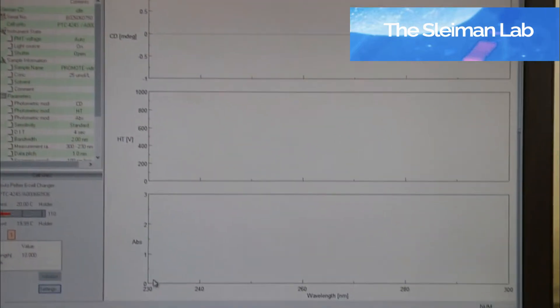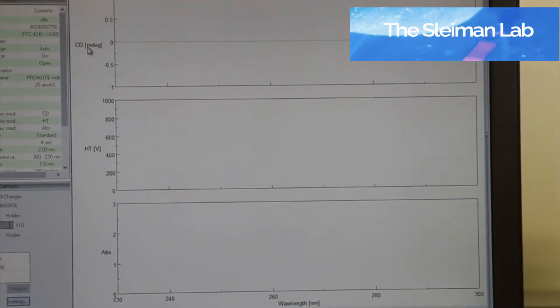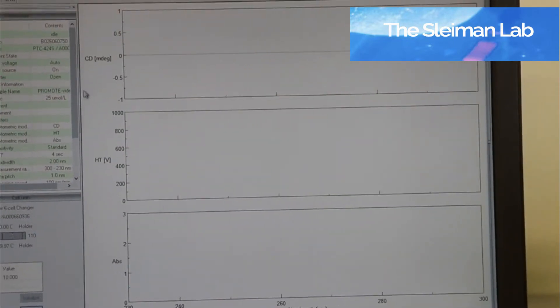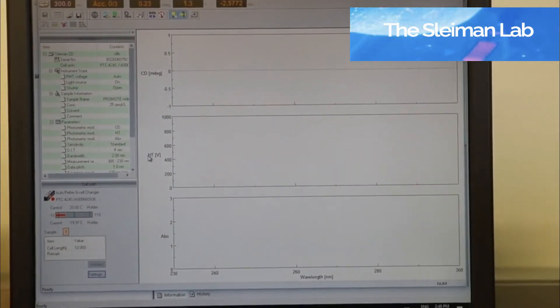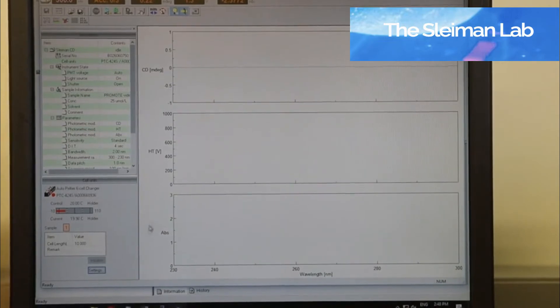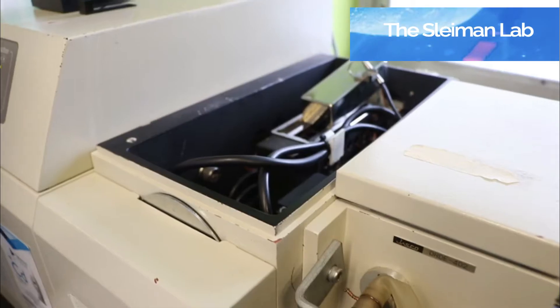Now I've defined that I want three values to be shown here: the actual CD spectrum, the voltage, and the absorbance.